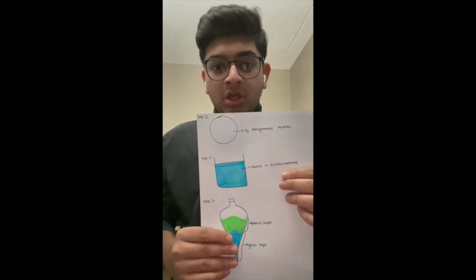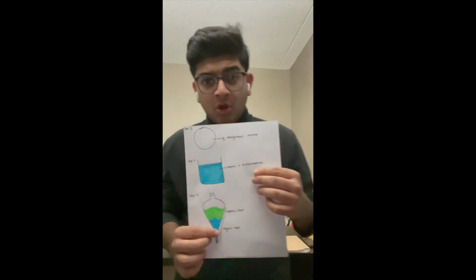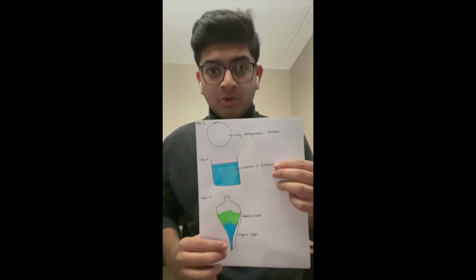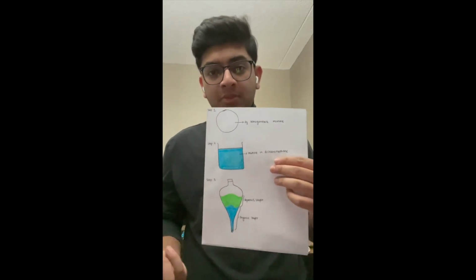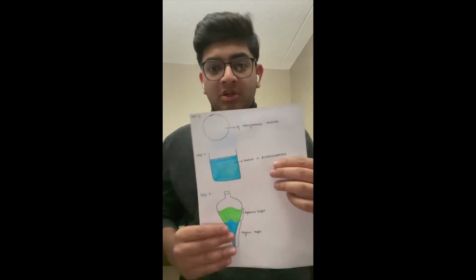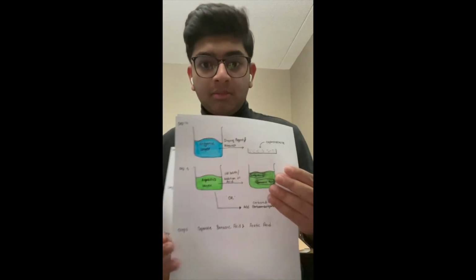Now, moving on to removing caprolactone in its purest form from our organic layer, we need to introduce our organic layer into a rotavap machine. A rotavap machine is used to distill out the solvent, leaving the pure compound behind. So, after the procedure of rotavap, we would get our caprolactone in its purest form.